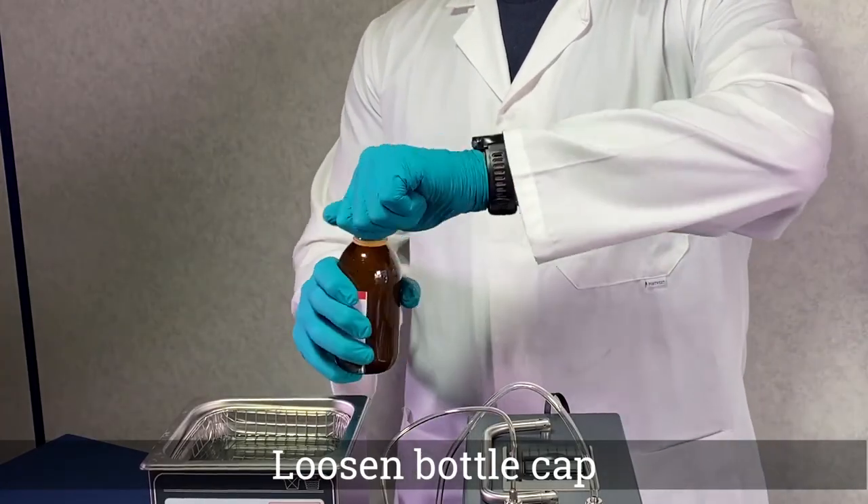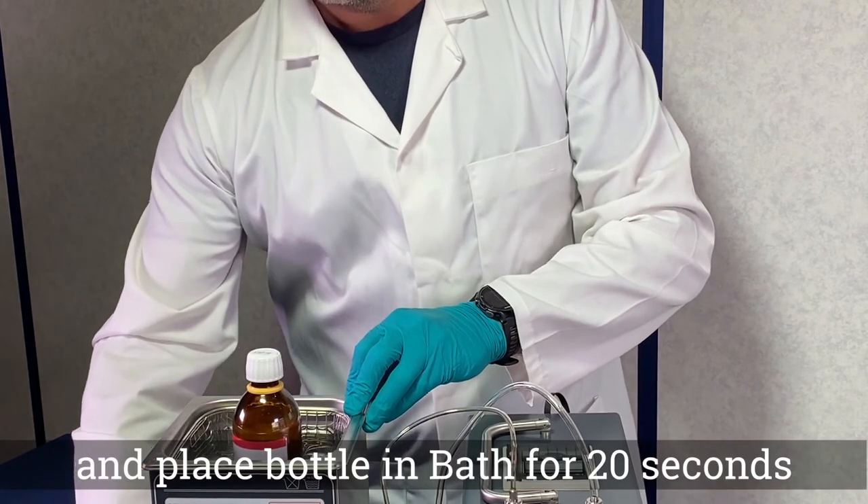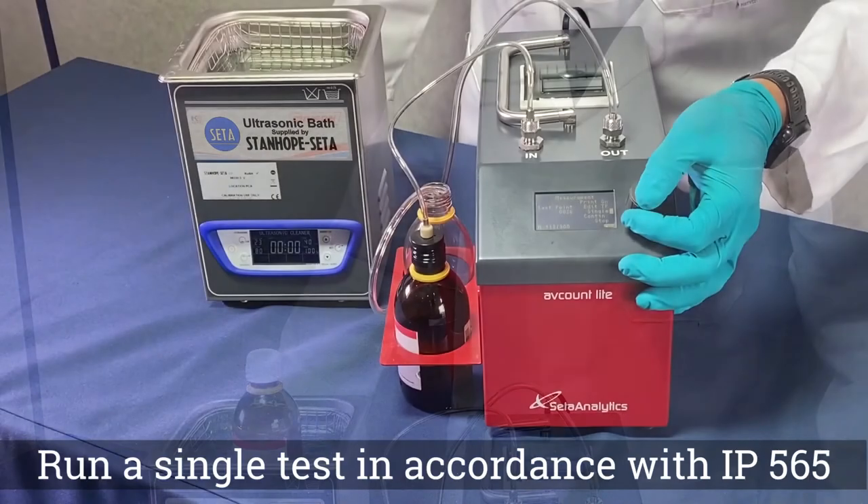Step 4. Loosen the bottle cap, place in the ultrasonic bath and run for 20 seconds. Use the stopwatch.